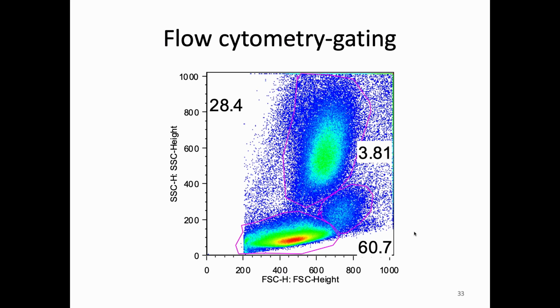Yeah. So I have two questions. Yep. First one is you would have to separate white blood cells from red blood cells before doing this. Yes. And second question is why make the polygons so large? Why not focus in on where it's green or where it's red? That's a flow cytometry person argument that we have all the time. And so that's one of those things we could talk about, thinking about how that would actually work on an individual experiment, after class if you want.